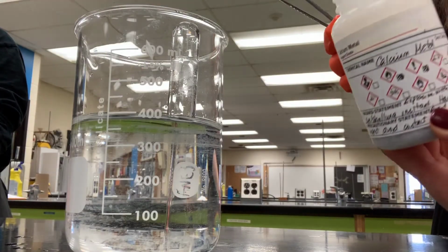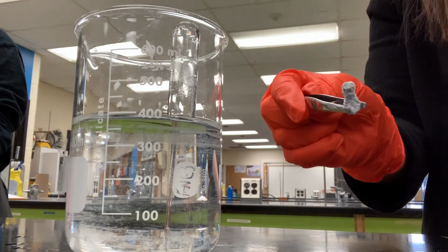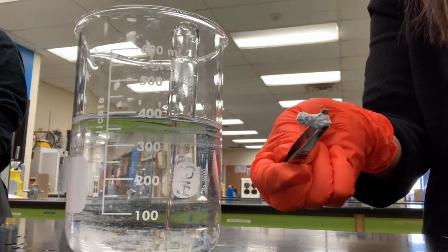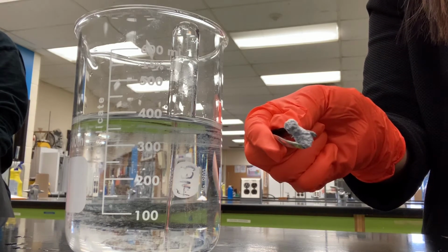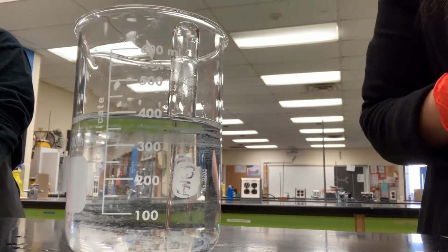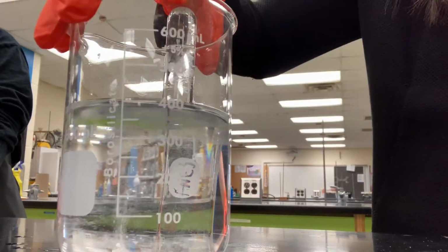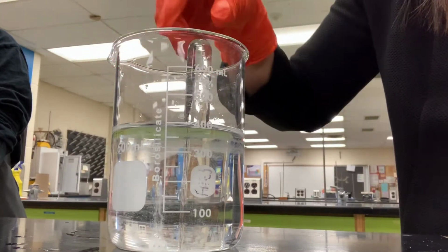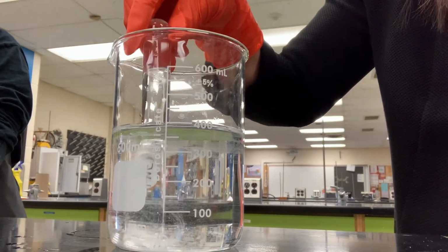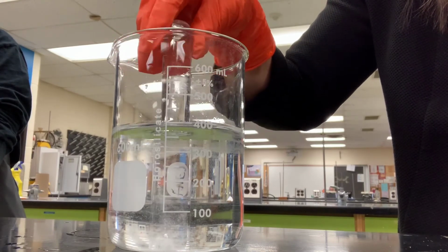What we're going to do is take a piece of calcium metal, one of our alkaline earth metals, and we're going to drop it into the water. And we're going to see that it's going to start to bubble there. There we go. And we're going to put our test tube over top of that piece of calcium.